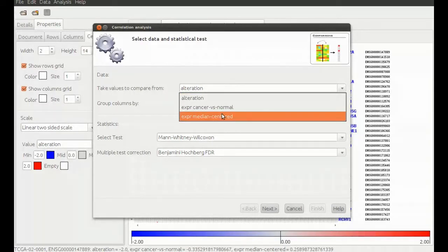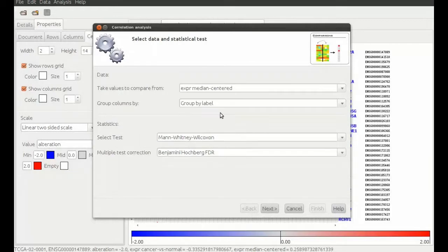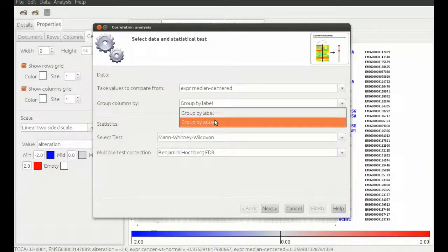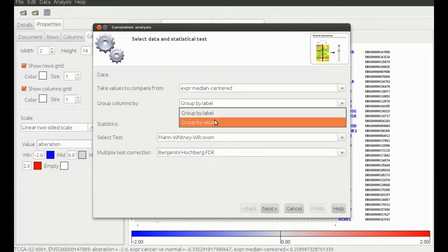On the first page of the analysis wizard we choose expression as value dimension to take the values to compare. The two sample groups to compare to each other depend on the gene's alteration so we choose to make the group by value option.